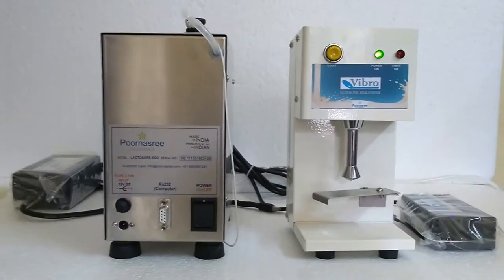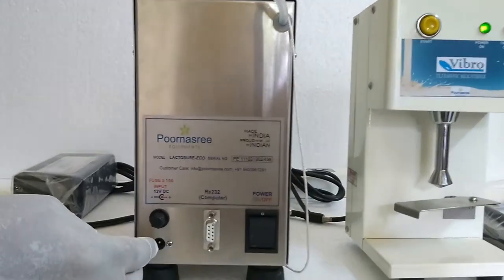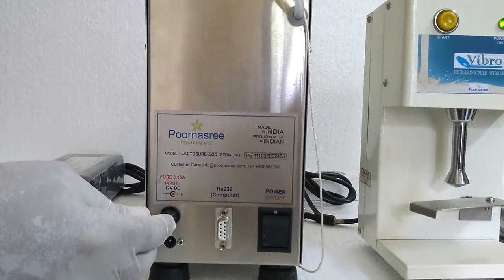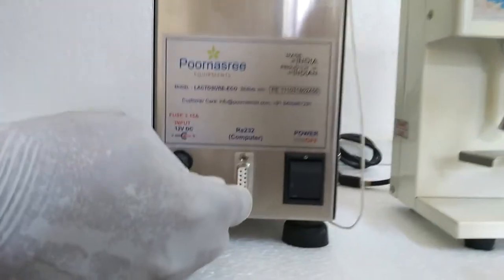Let us see the connections and controls on the back side of the LactoShure Echo. This is the 12V DC power supply. This is fuse protection of 3.15A. This is the RS232 connector for connecting to a computer. And this is the on/off switch.